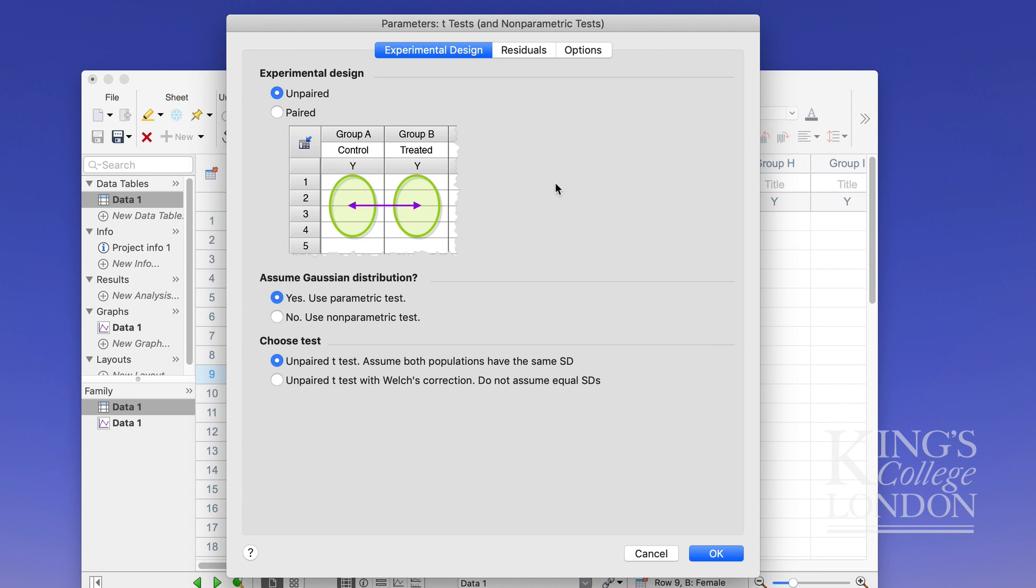The next choice box allows you to decide whether you want your data paired or unpaired. Well clearly this example is using male and female data and therefore the results cannot be paired.